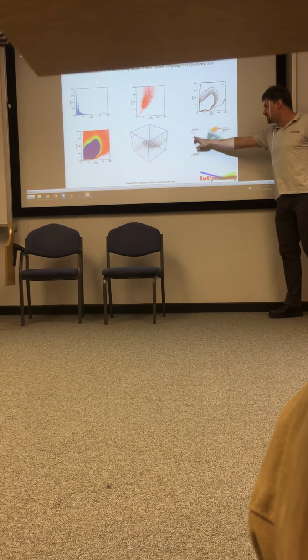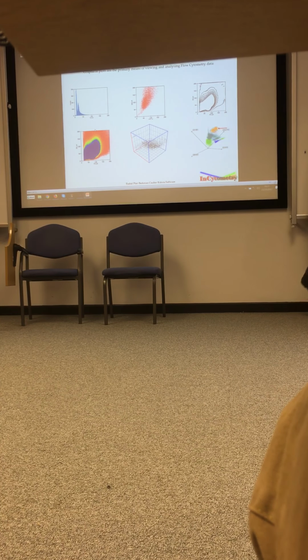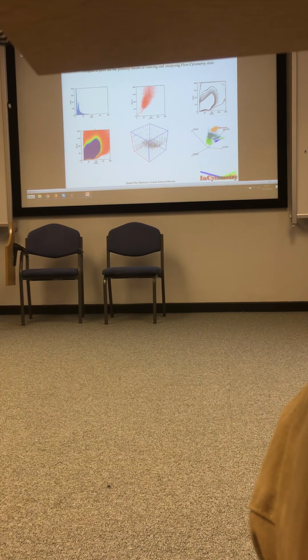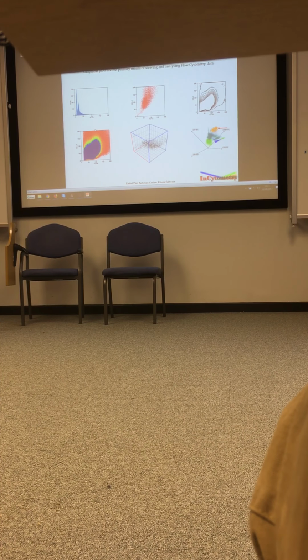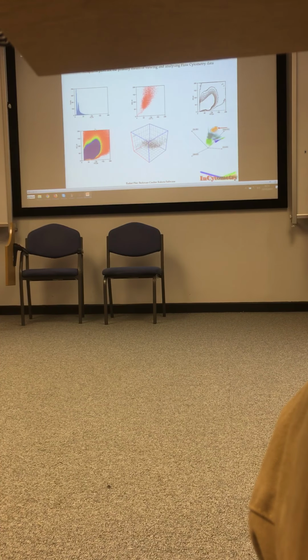Then we've got this radial plot. This is in the Kaluza software, and this was an attempt to deal with the problem of modern multicolour cytometry. One of the issues with cytometry these days is, how do you analyse data from, say, a 13 colour assay? It's fine if you've got a predetermined gating strategy. What if you haven't got one? How do you analyse 13-dimensional data? If you printed out all of your possible plots, we would fill that bit of the floor there with plots. That's not particularly helpful, because you can't look at all of those and analyse them.